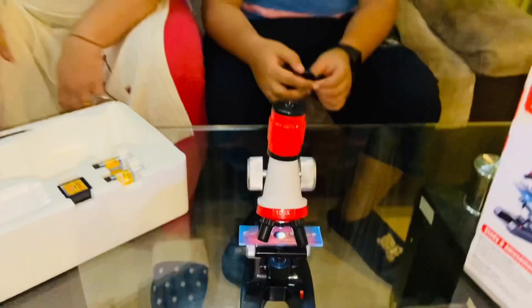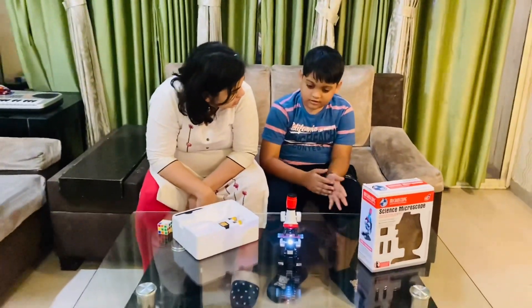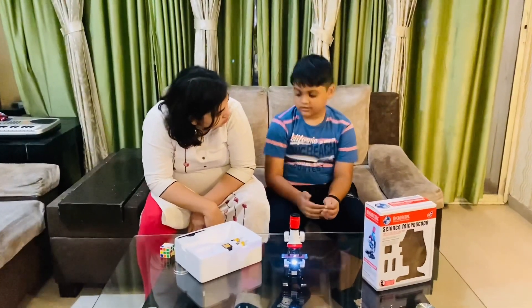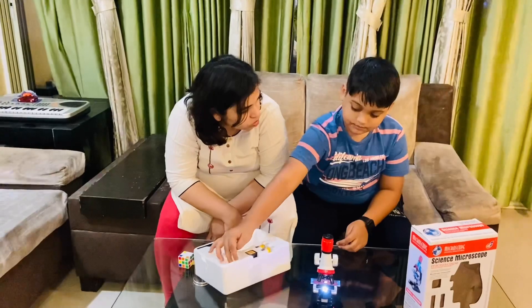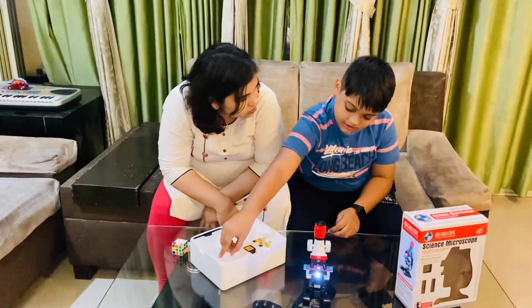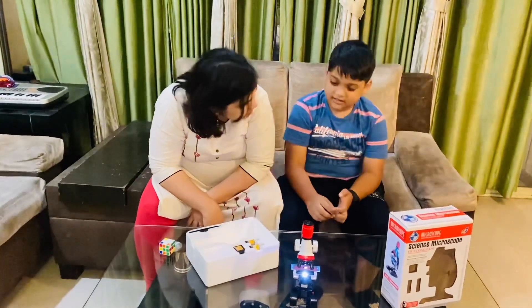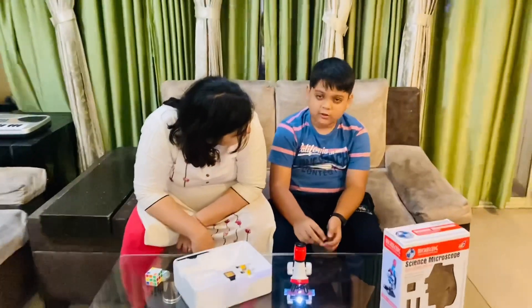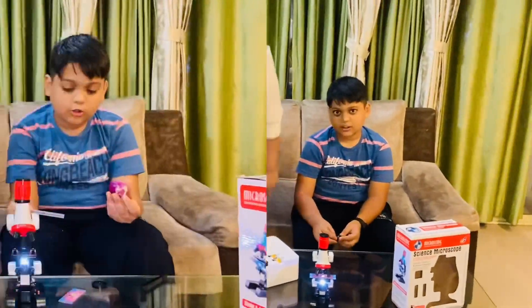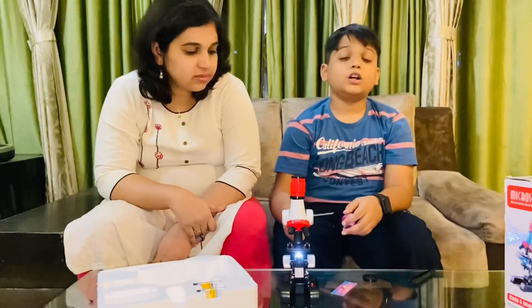So what specimens are you going to use? I want to see something — can we try to see how an onion looks under the microscope? It won't quite fit, but I'll give you a small slice. This is an onion slice we've put on the slide — now we're going to check how it looks.